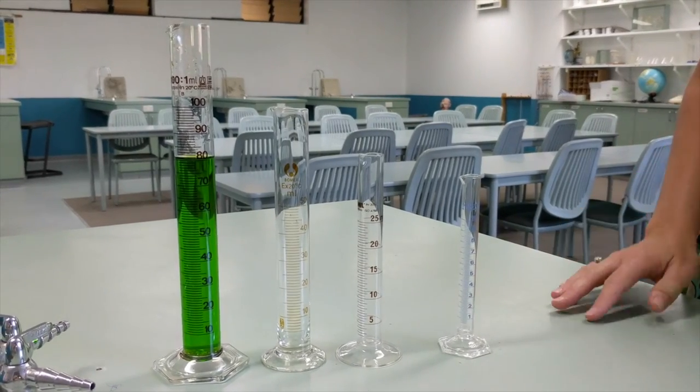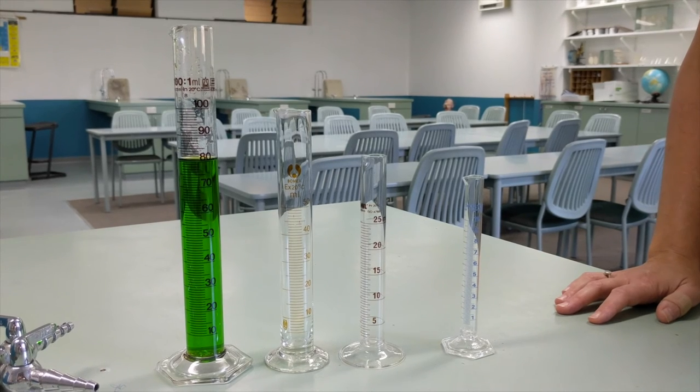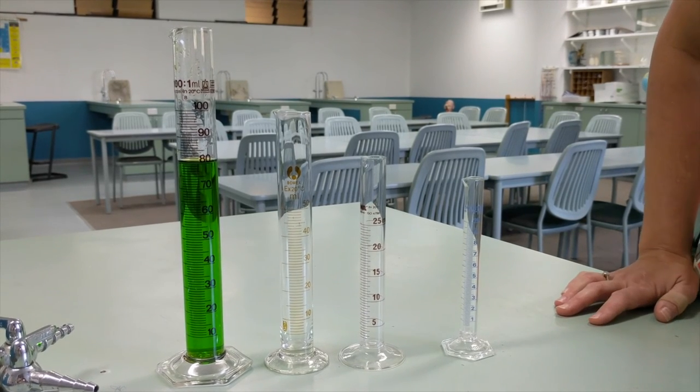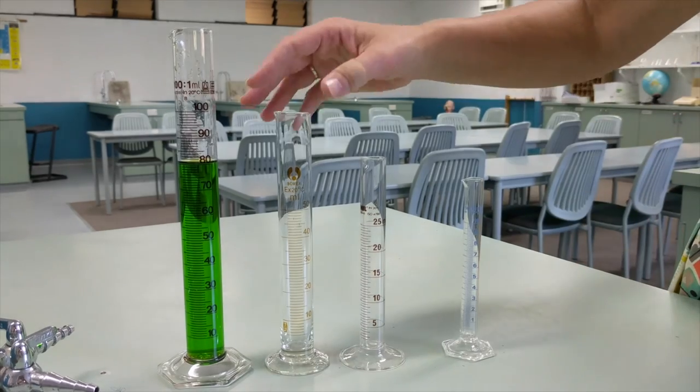As you can see, there are lots of different sizes of measuring cylinders. Use the smallest one to suit your needs. For example, if I needed to measure out 40 mils, I'd use this one.